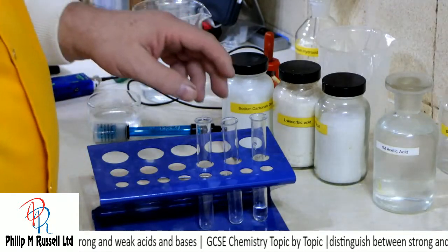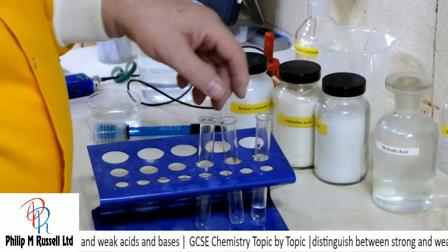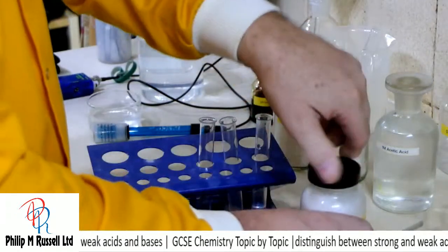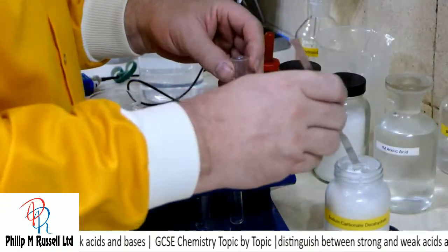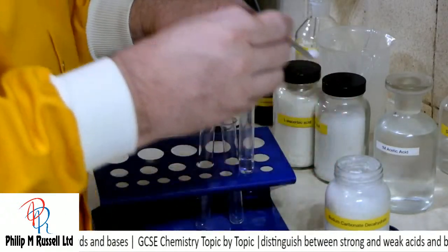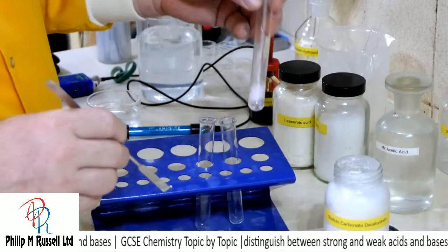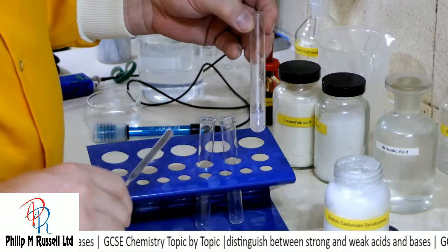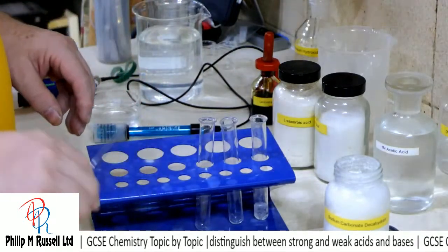Okay, let's take this, and what I'm going to do is react it with the sodium carbonate again. Let's have a look and see what happens. And we're seeing a reaction similar to perhaps about the 1 molar hydrochloric acid.